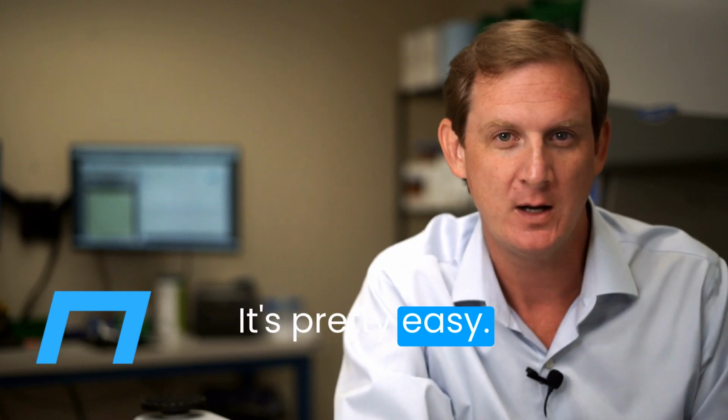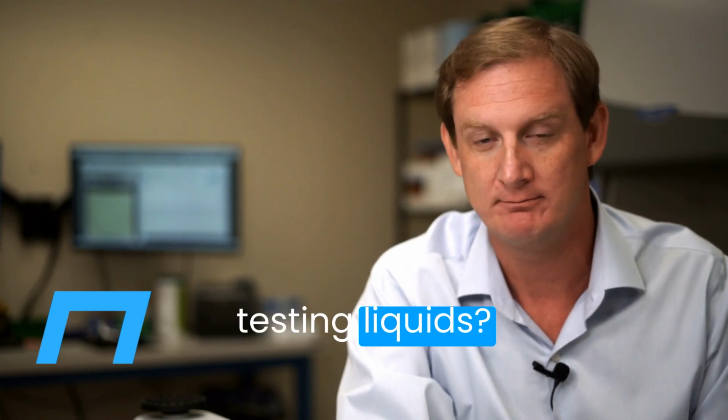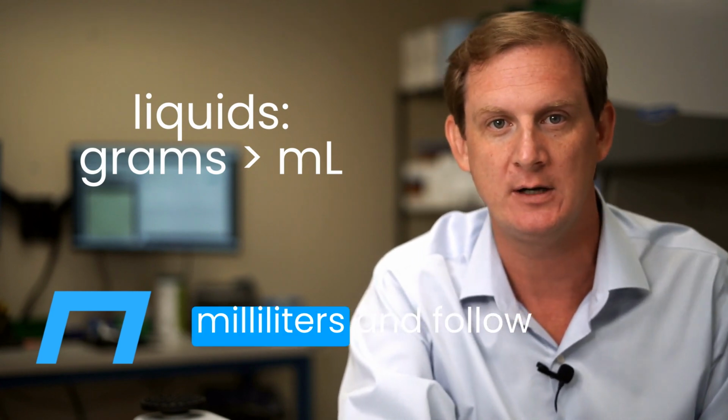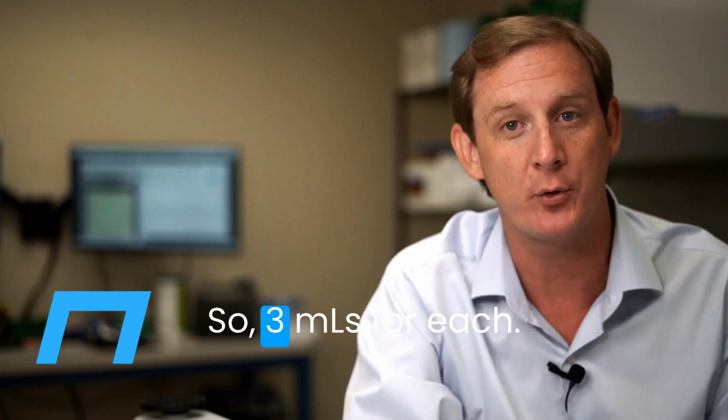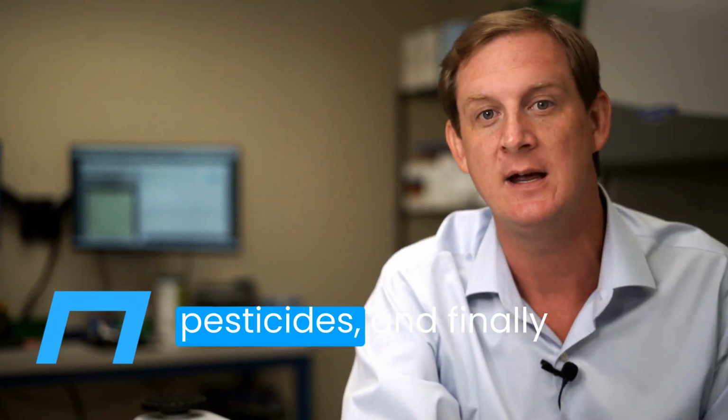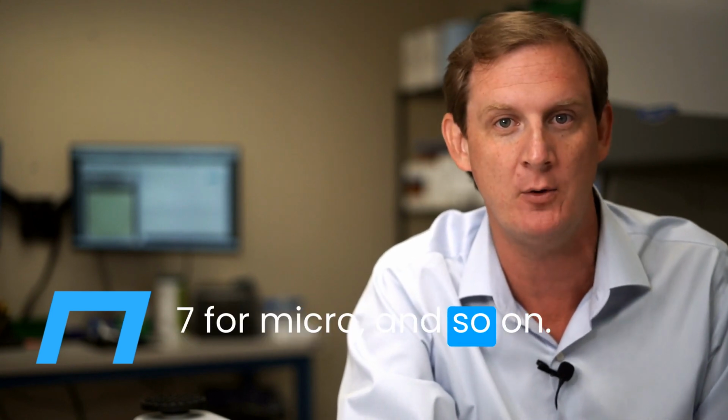It's pretty easy. But what if you're testing liquids? That's also simple. Just convert grams to milliliters and follow the same formula. So 3 mLs for each: potency, terpenes, pesticides, and finally 7 for micro, and so on.